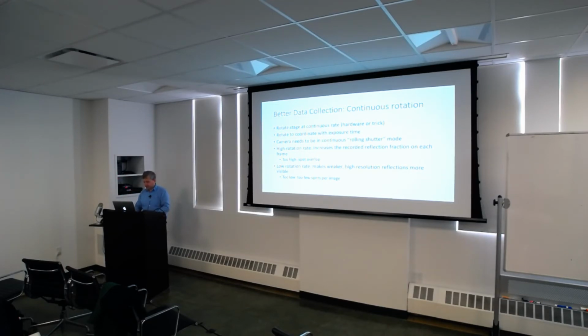I should say that downstairs our F20 is set up the same way. We have an F416 camera in addition to the DE camera, so we can do this sort of experiment. We don't have the continuous rotation device, but I found a little weight that is the right weight that seems to rotate at about the right speed. But we haven't done too much of that yet.